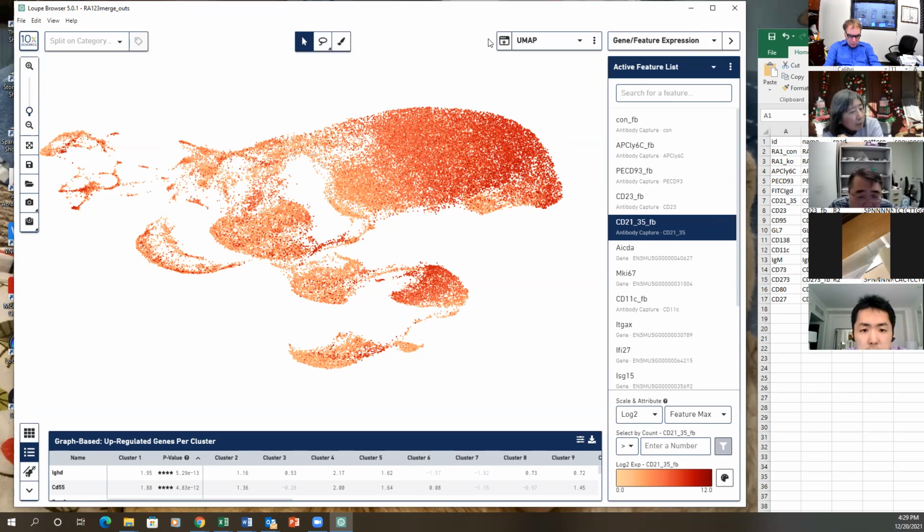You said apple. What is the apple? You said apple. FO, follicular. FO, yeah, FO. Okay. The word is transitional. Right, transitional. In a way, it's funny. Yeah, transitional. What I noticed is that it's closer to germinal center. So it is true, transcriptome wise, they are closer to it.